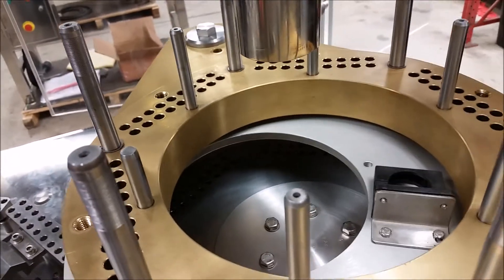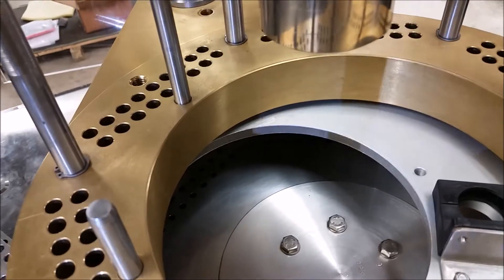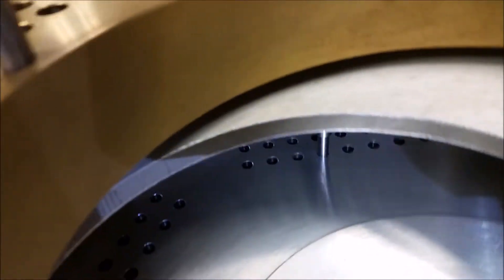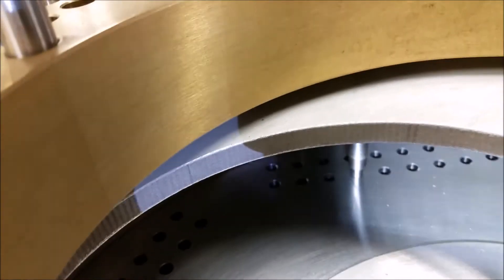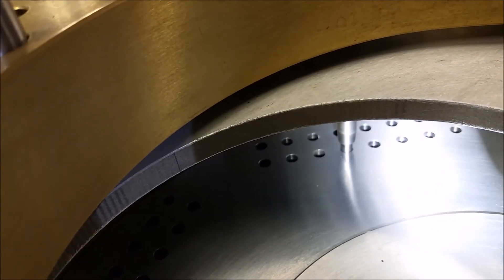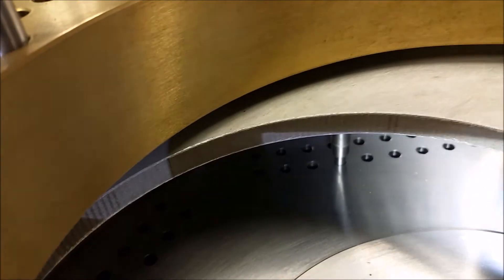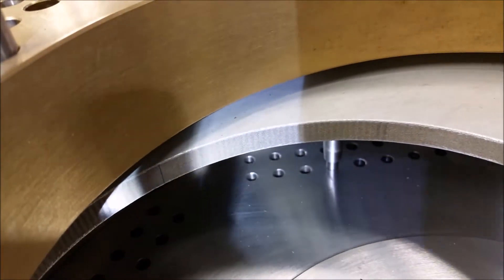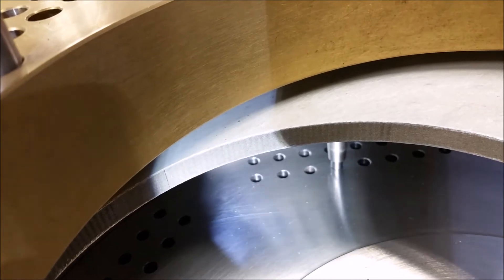Once you've got that, take your alignment pins for your tamping head and you're going to put it down, making sure that it's going in at the bottom. Then your other one you're going to want to do on the opposite or almost opposite side to make sure that it's aligned on both sides. You do not want to drop these pins in from the top — you can mushroom the bottoms and then they won't go in correctly.